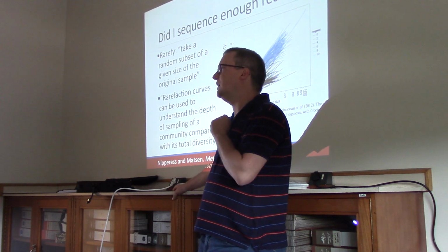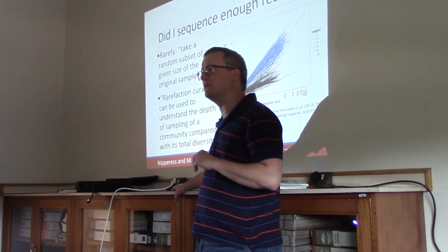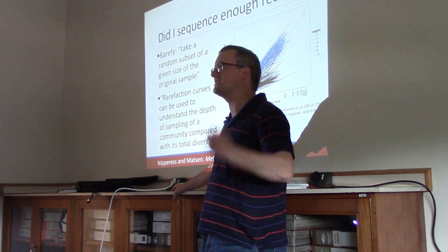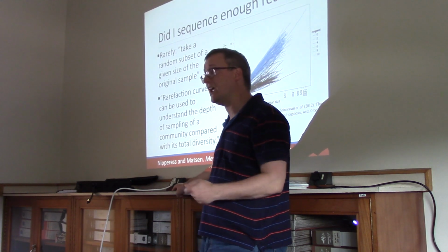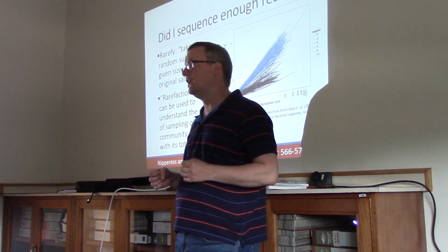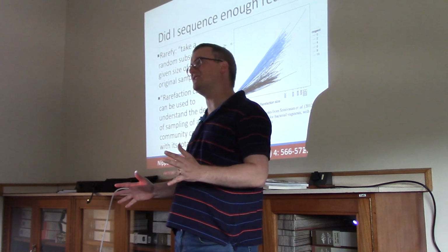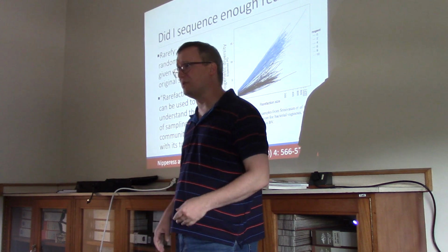So, if 5 years ago you ran a MiSeq on your microbiome sample and you had all of the sequence data produced from it, maybe at that time you thought, my gosh, this new instrument is so fantastic, I must have a comprehensive sampling. Just the same today, maybe you're sending your samples over to CPGR for sequencing on the Illumina NextSeq 500. Well, I hate to break it to you, but today, the NextSeq 500 is not considered the top-end sequencer for world research, right?